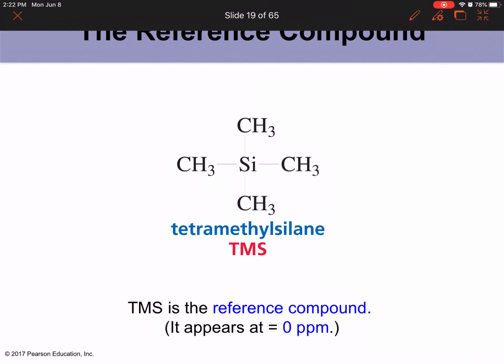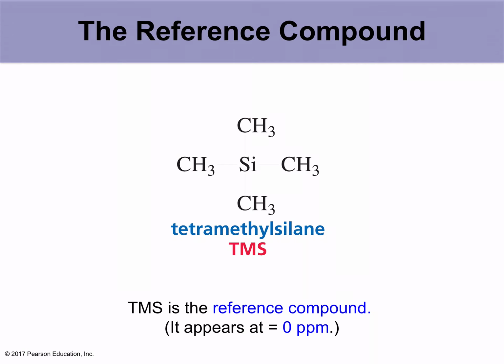Hello everyone, here we are again back to our chapter 14. In this section we're going to continue what we've been learning about the NMR signals and how to interpret data to get a complete picture of the molecule.